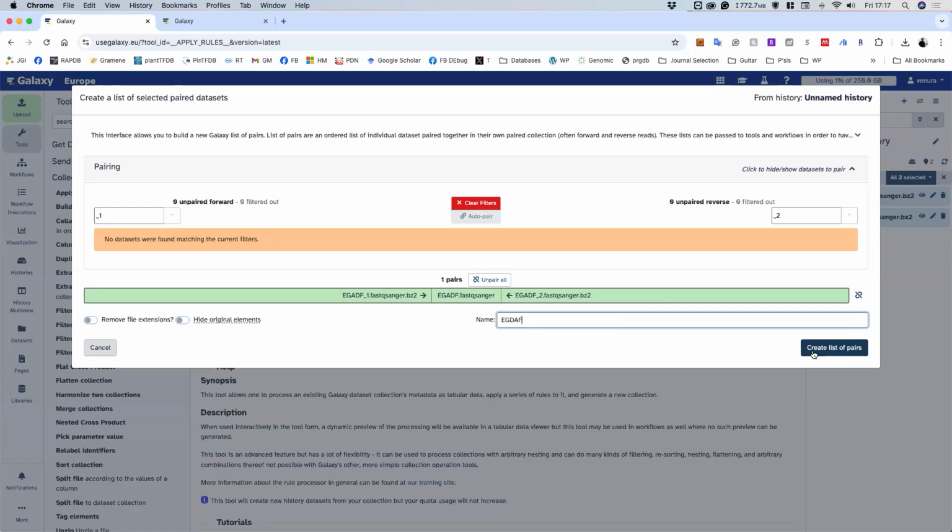Yes. Thank you, sir. No problem. Okay, so shall I click on the create list of pairs? So then we can move forward. Others, if you guys have any issues, let me know.